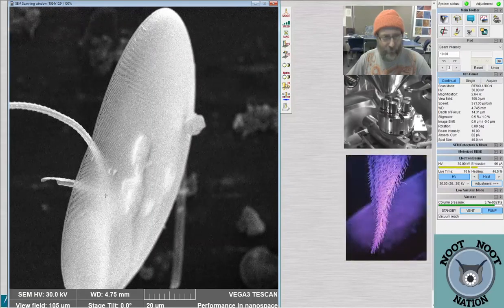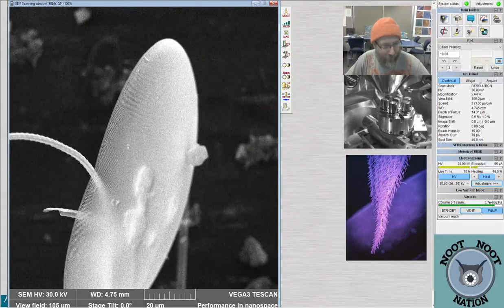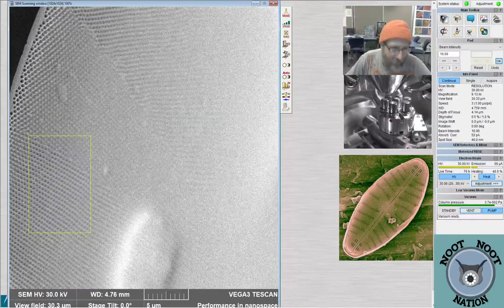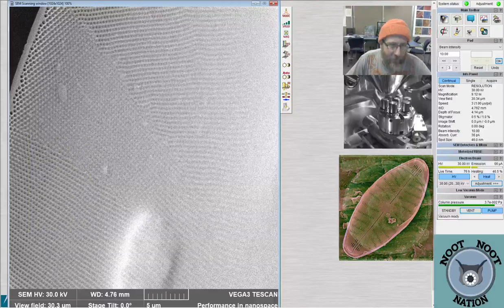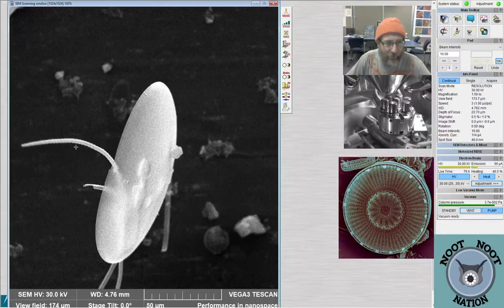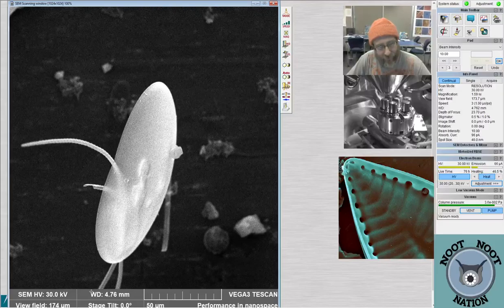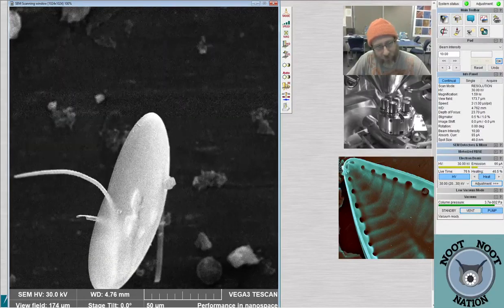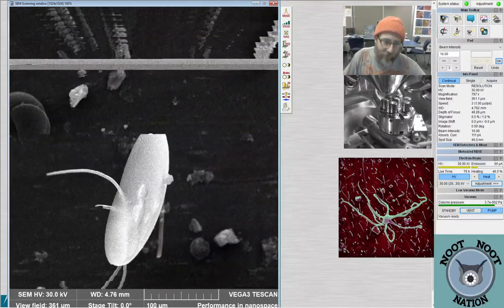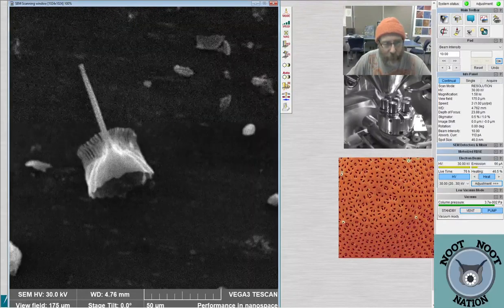What? It's a big white splodge? I mean, it's a diatom. Oh, wow. It is. It's very strange. Is it too bright? Is it Chaetoceros? What are these things coming out? Is this a Chaetoceros that's just stuck on it? I think that's just a Chaetoceros that's stuck on it. That's the Chaetoceros spines coming out from there. I don't know what this is. I mean, I know it's a diatom. It looks like a giant shield. It does, doesn't it? Not sure what that is. Look back here. Nope, normal Triceratium.